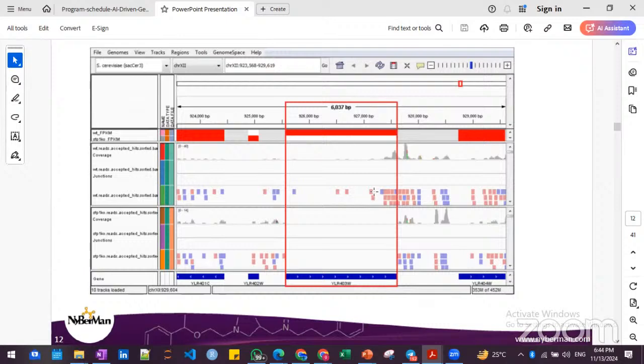Yeah, so we have marked it here, and then we can see that on this particular chromosome, this position, we have this gene. So this is the BAM file. Okay, and this is also the bed file. So that we can see here, we can see the gene is here, and how the samples.